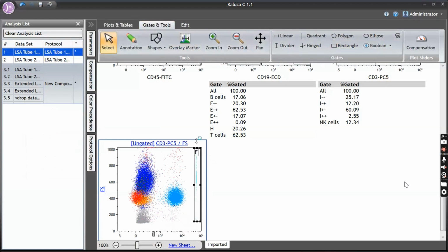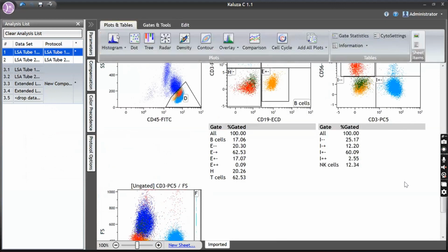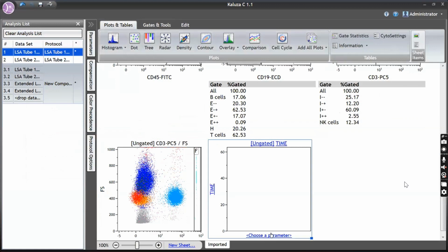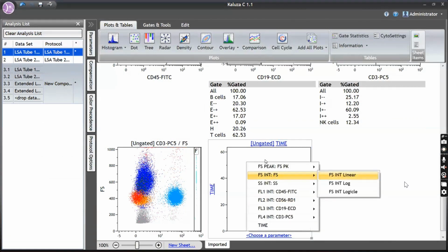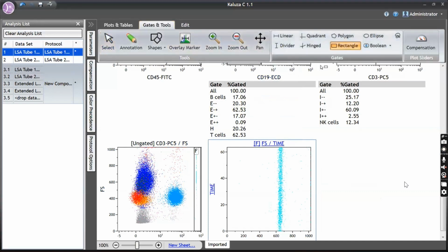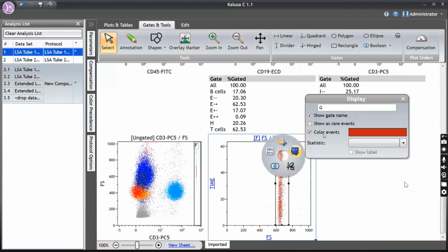Okay. So I can still refine them with the time plots, whether this one we have already done with CD34, something very similar to that. Once you do, you just gate this and label them as beads.